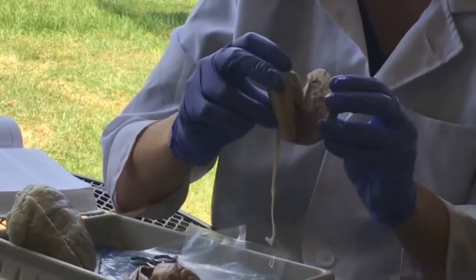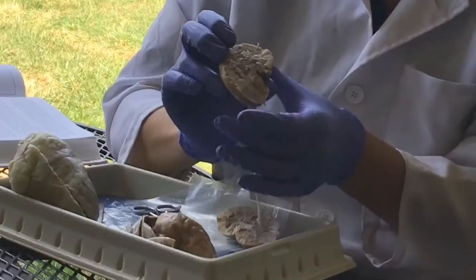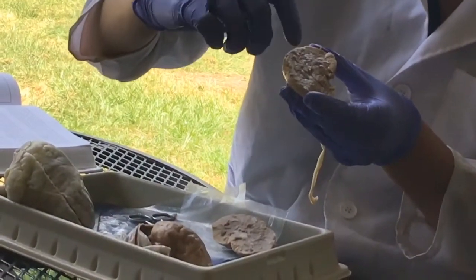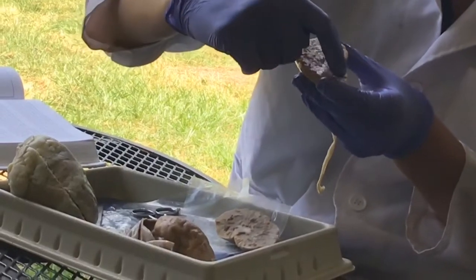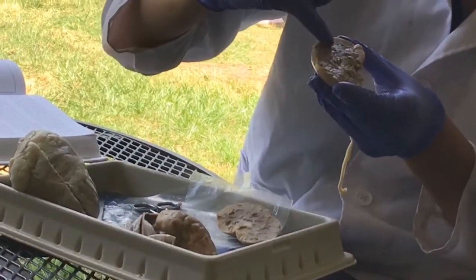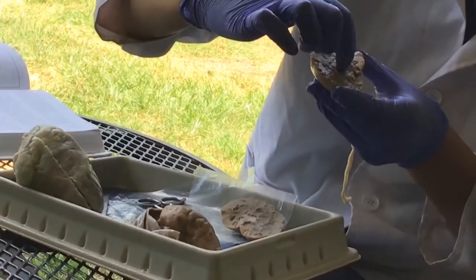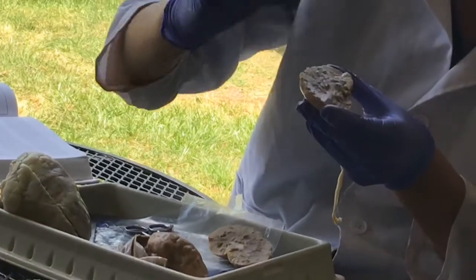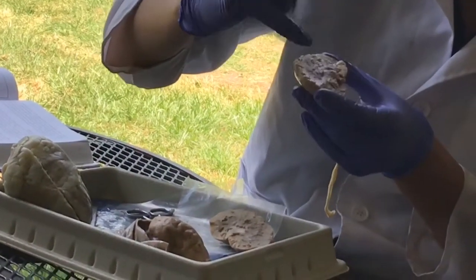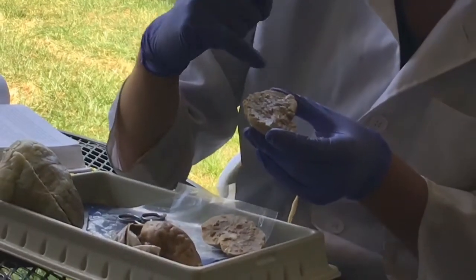So when you cut open the kidney, you're going to see that it's got a very, very dense, although kind of spongy appearance to the tissue on the outside cortex of the kidney. That is where all that filtration occurs. And then in the center here is more like a collecting pelvis area of the kidney that's going to collect the urine and also have the vein and artery running to and from each kidney here.